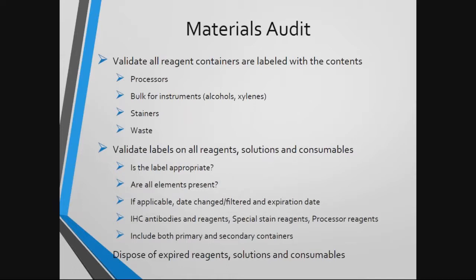Another activity I will perform about 2 weeks prior to our inspection is an audit of the materials in the department. We perform quarterly audits as a general rule. However, I like to go through everything just to make sure there were no oversights. By materials on the slide, I'm referring to reagents, consumables, bulk liquids, waste, general supplies, etc.